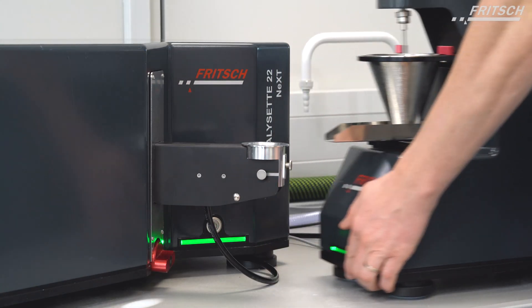Hello and welcome to the newest Fridge product video. As you know, we released the A22 Next with the wet dispersion unit, which was quite revolutionary about two years ago. Now I would like to introduce to you the first sibling — a dry dispersion unit.